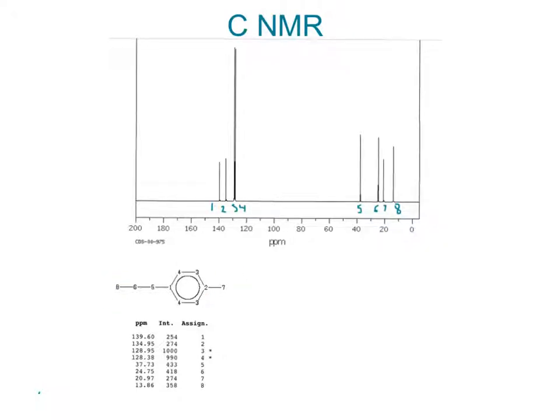For chemical shifting, the carbons on the aromatic ring do not stray too far from the expected values of roughly 120 to 160 ppm. The same goes for the carbons on the CH groups that range from roughly 10 to 40 when it should be around 5 to 55.